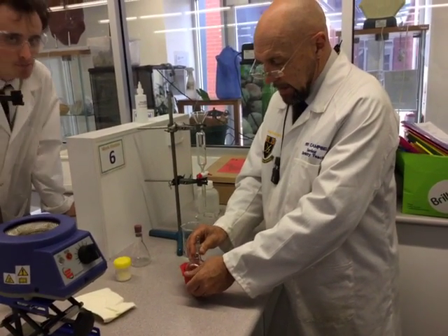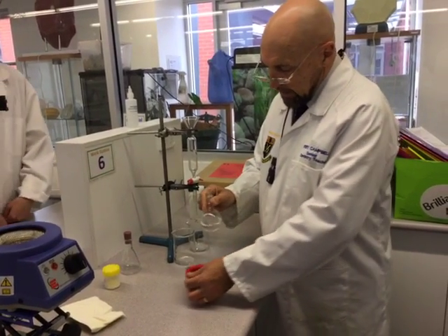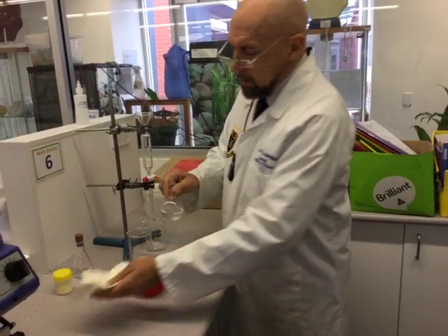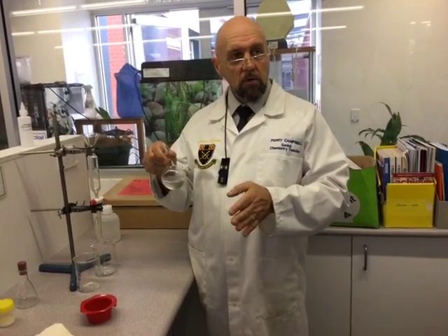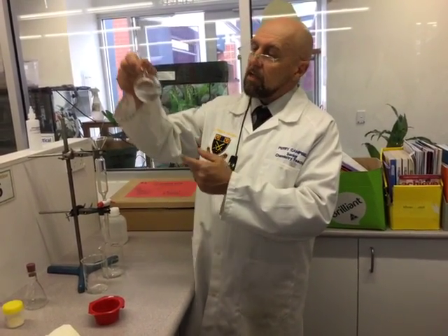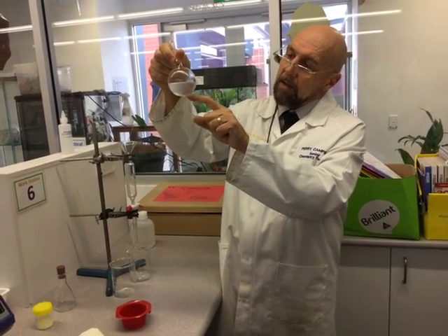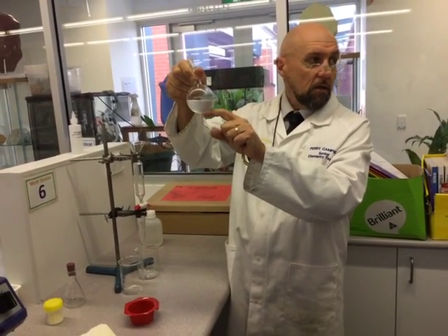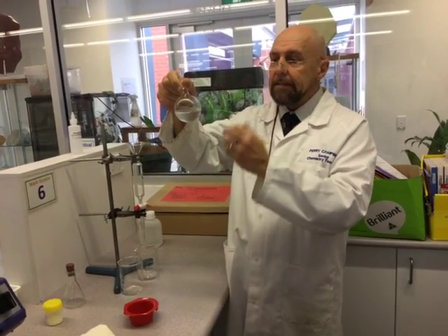What we are looking at now is our ESTA product. When you're doing a practical, you've got to make sure that you're getting what it looked like at the start, what it looked like in the middle during reflux, and now we're trying to work out what it looks like at the end. You probably can't see it in the video, but there's a very small layer down the bottom — distinctly two layers here. That's the thing you need to observe.